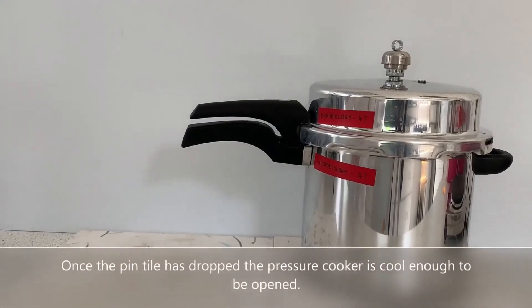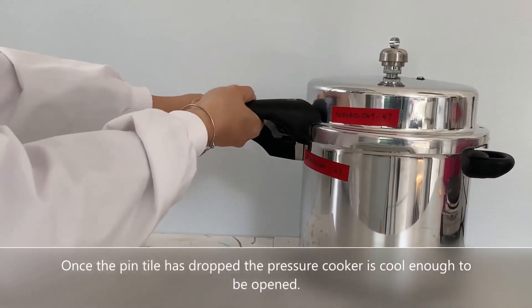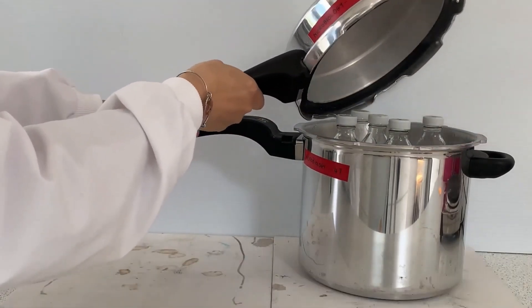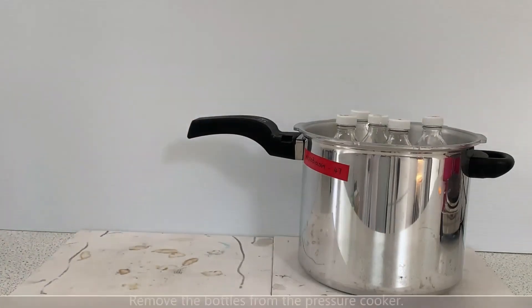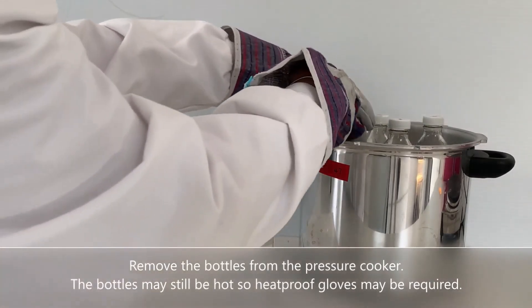Once the pin tile has dropped the pressure cooker is cool enough to be opened. Remove the bottles from the pressure cooker. The bottles may still be hot so heat proof gloves may be required.